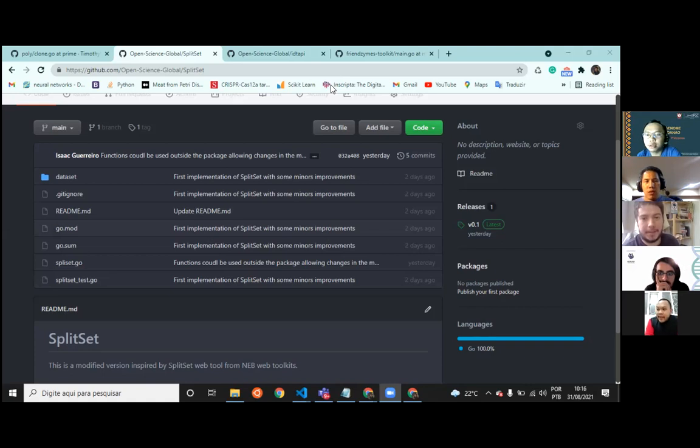Yeah. From the top of my head, the base caller, which is the primary base caller that transforms the electrical signals into bases, that's Guppy. Although again, there are open source alternatives, but the standard basic functionality is with Guppy, and then we use Medaka. Medaka is the one that does the job of assembling the fragments together, including giving out the scores and everything else. So basically, those are the two major softwares that are being used.